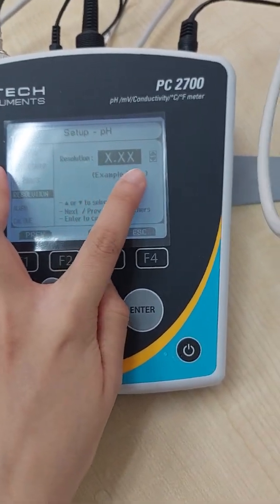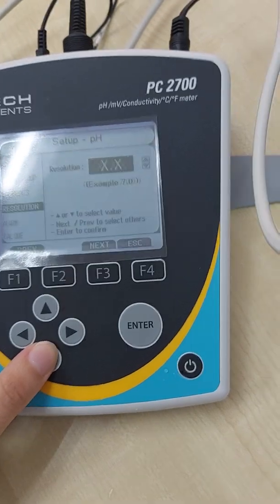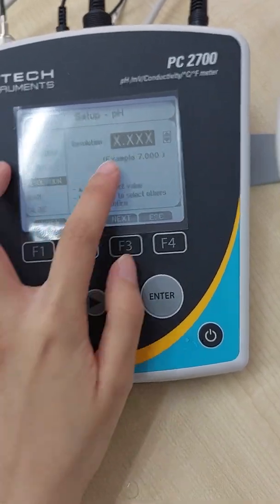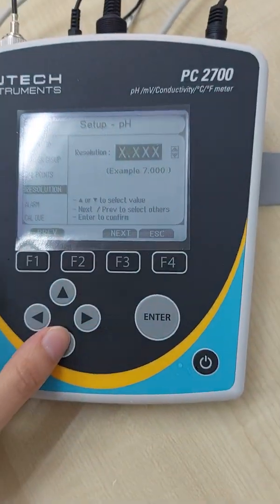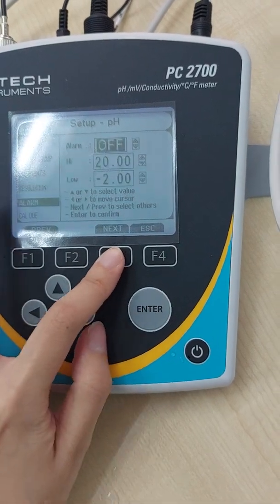Resolution. Standard is two decimal point. However, you can set to one decimal point or three decimal point as well.